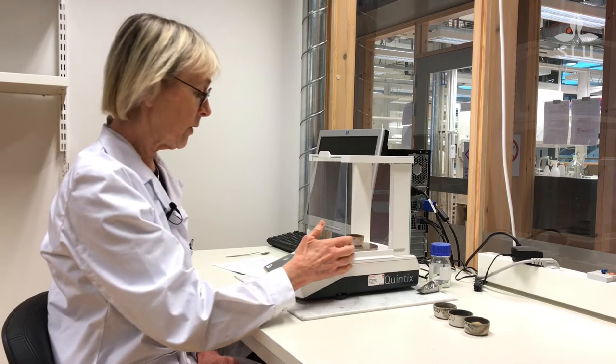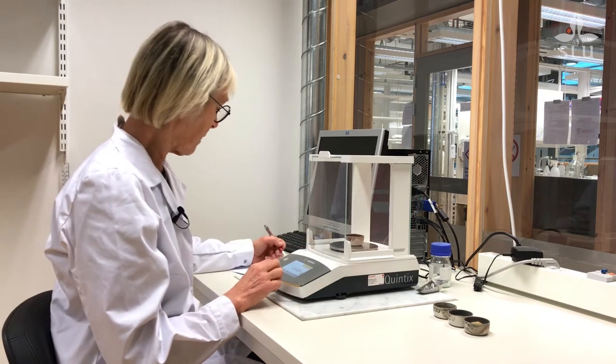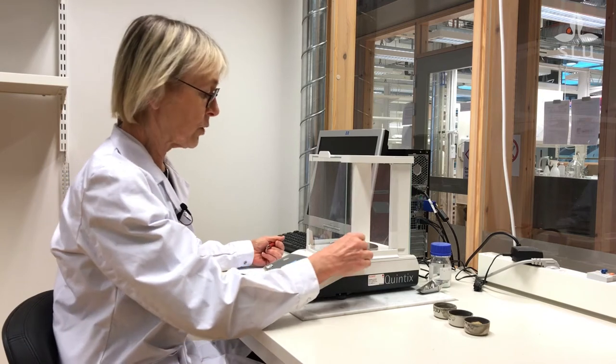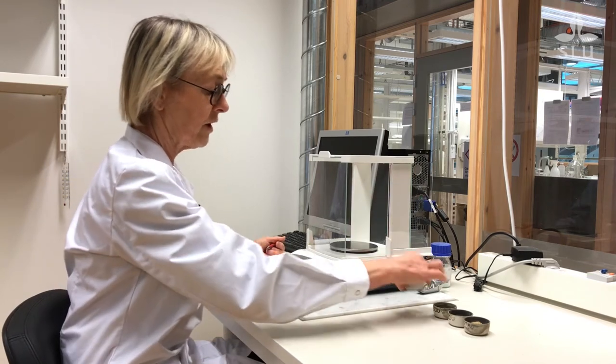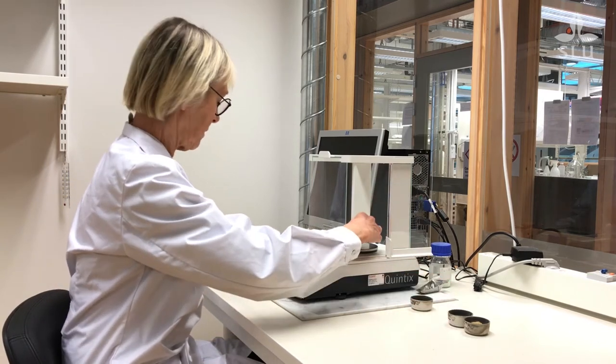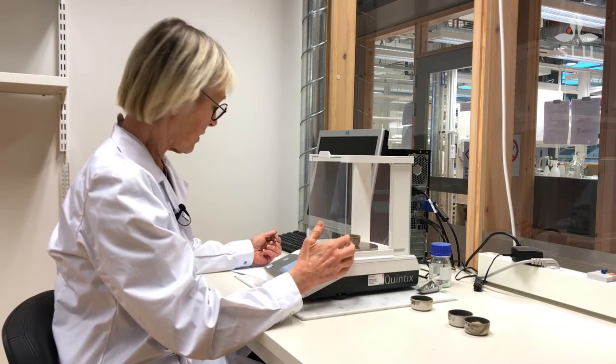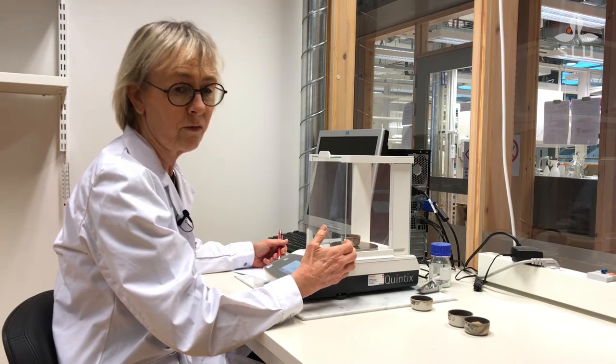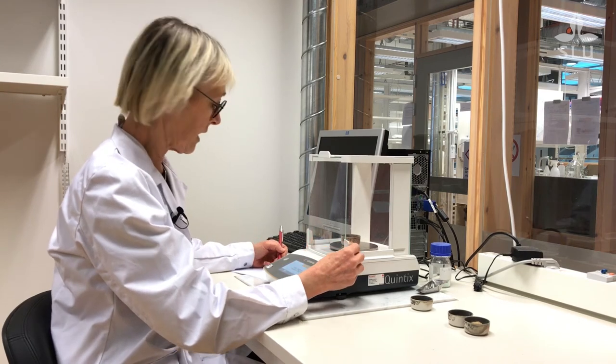I take the first sample, the rapeseed, and I can see it's about 20 milligrams heavier. And I'll check with this one — it's even more. It's almost 45 milligrams heavier.